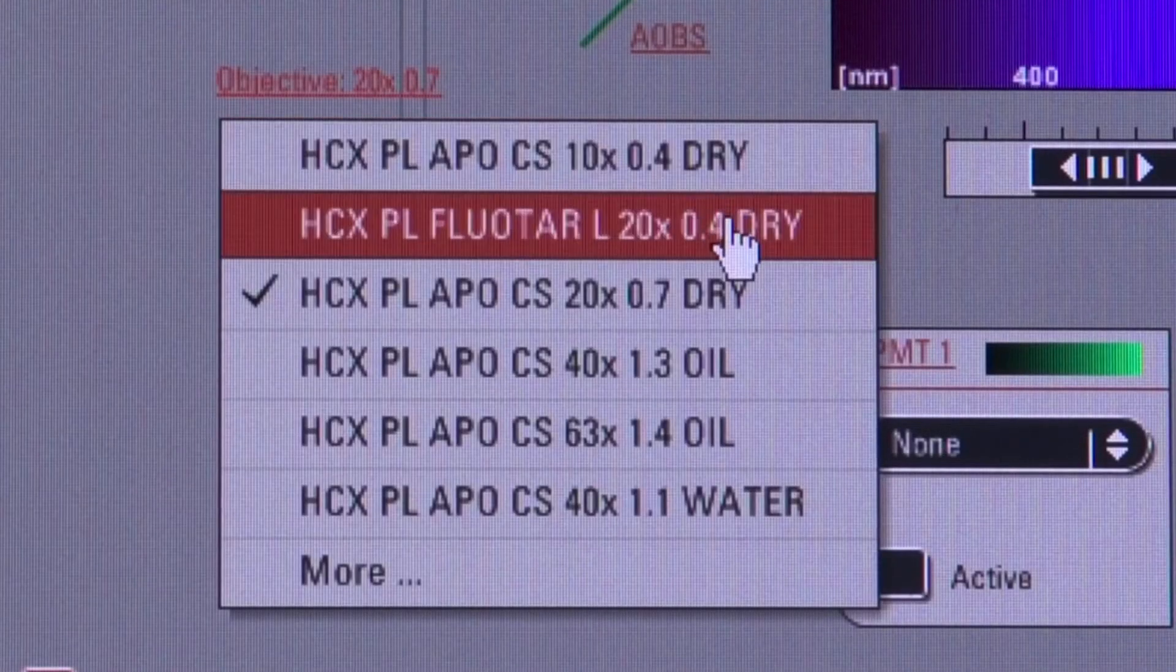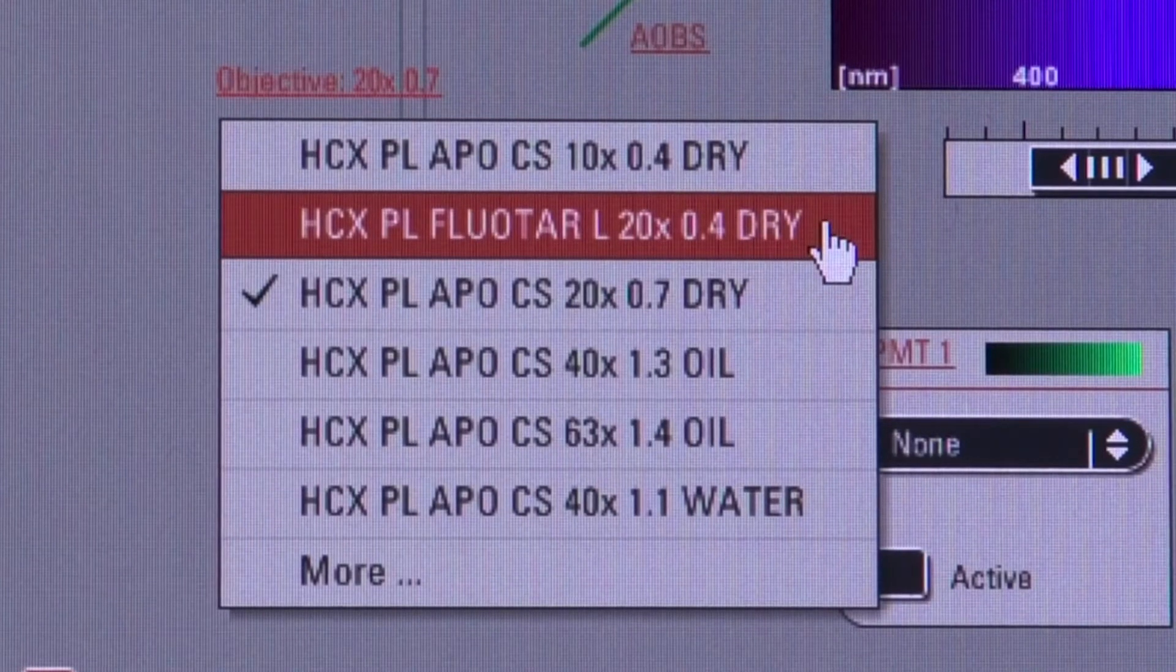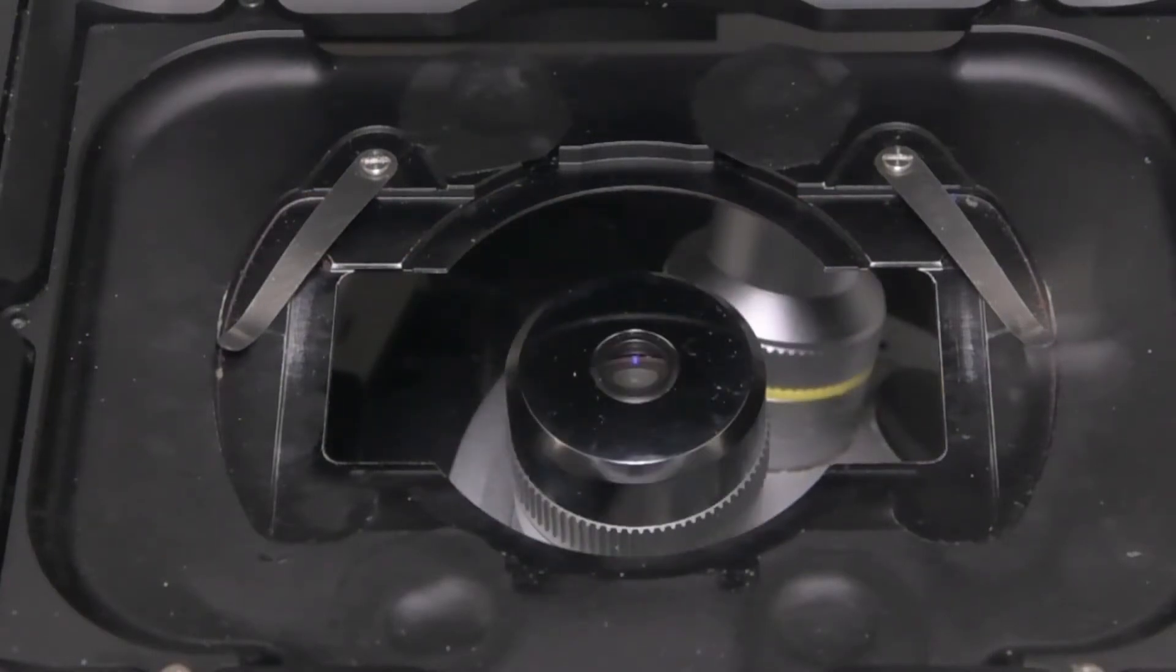Back in the objectives list, the 20X 0.4 NA lens is designed for long working distances. We don't use it often, but if you click on it, it also rotates into place. The 20X 0.4 looks like this. You can see that it is flat on top and sits deep inside. That's the 10X with the yellow band behind it.